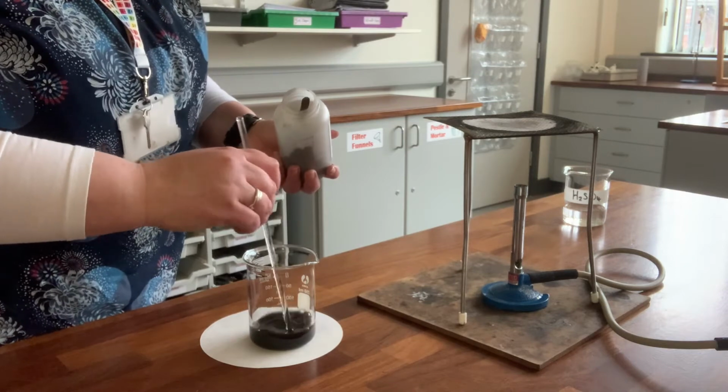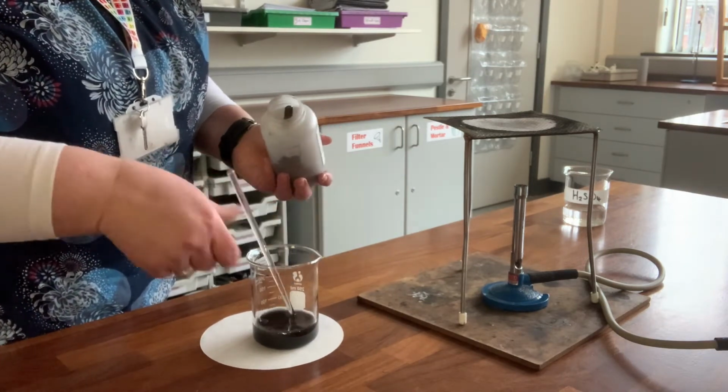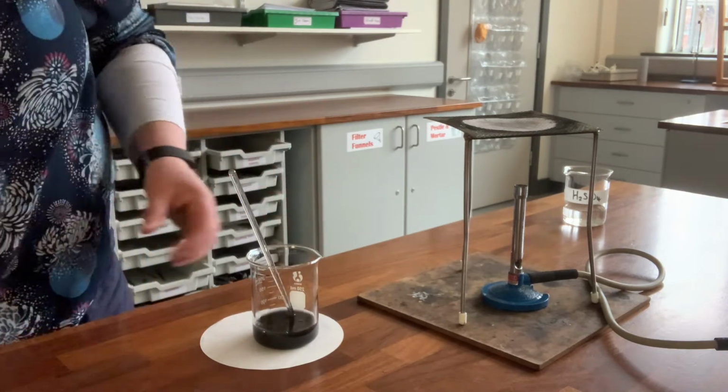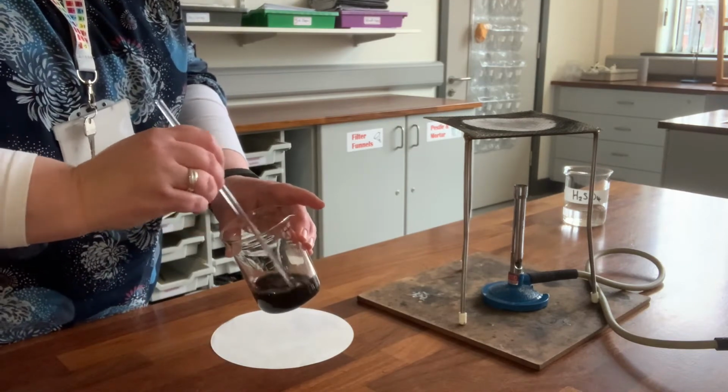So that the copper oxide will react with all of the acid and there'll be so much left that we'll have some black powder left at the bottom. So again, just to make sure, I'm just going to add a wee bit more. So we'll definitely know that we've got more copper oxide than we need to neutralise the acid.